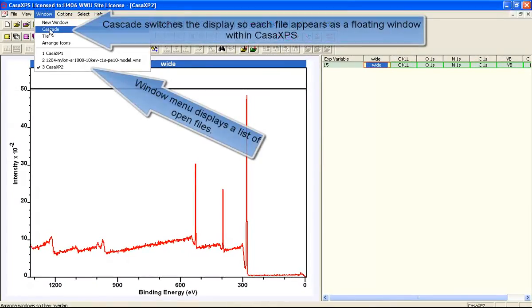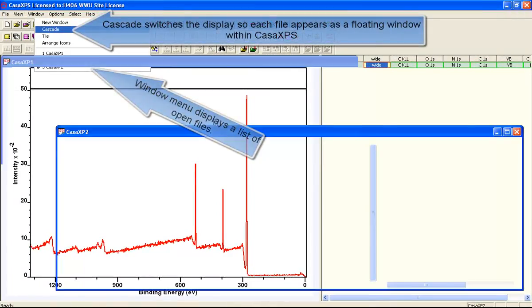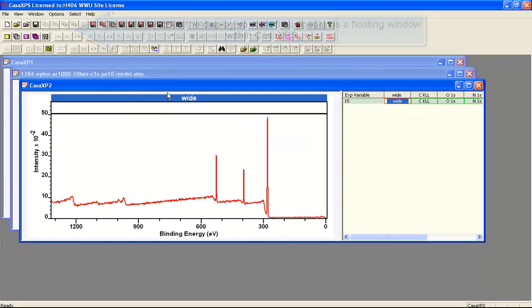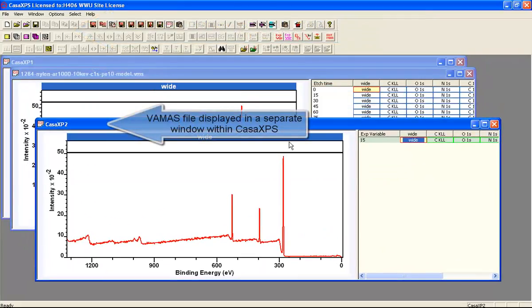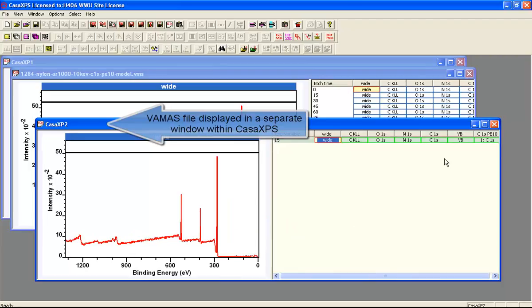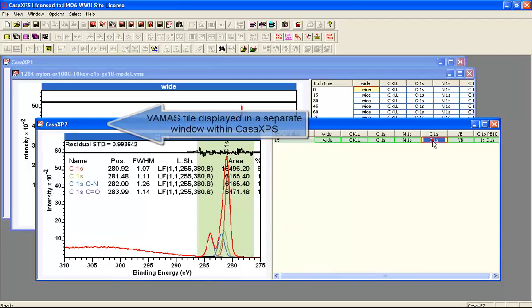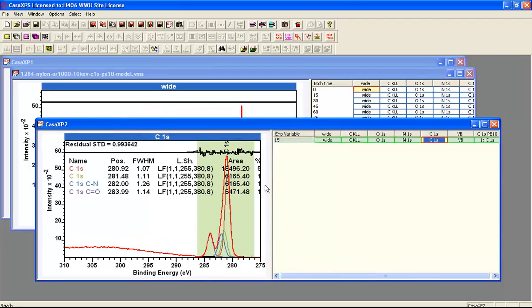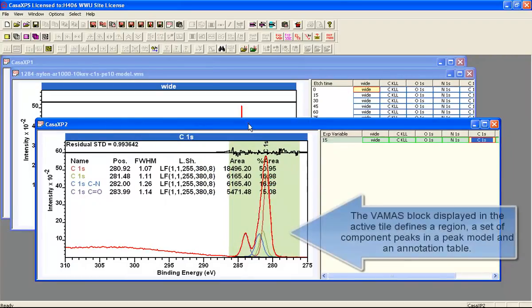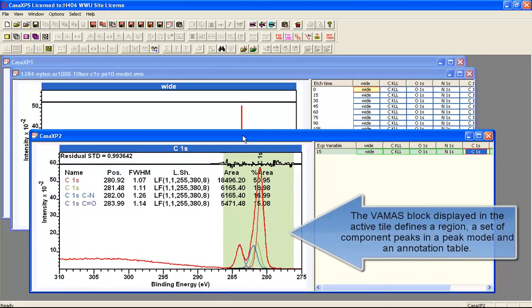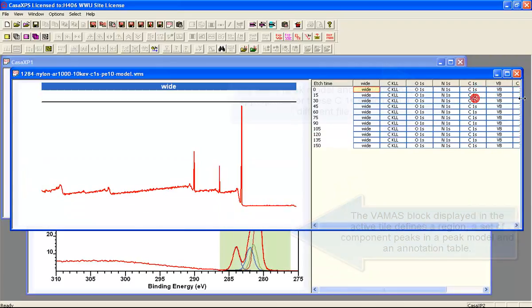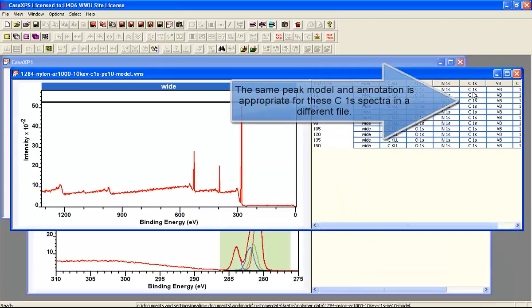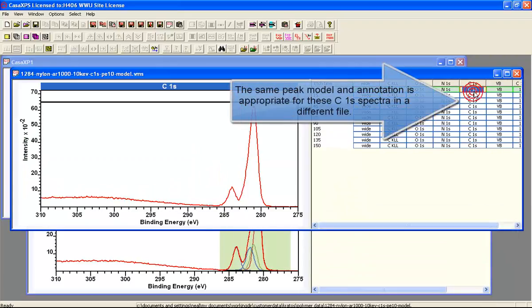Within CASA you can have multiple windows open, and one of the advantages of doing this is that you can prepare a peak model using one file. So in this example I've got a set of peaks defined on a carbon 1s spectrum, and then I have another file open which has a sequence of carbon 1s spectra.